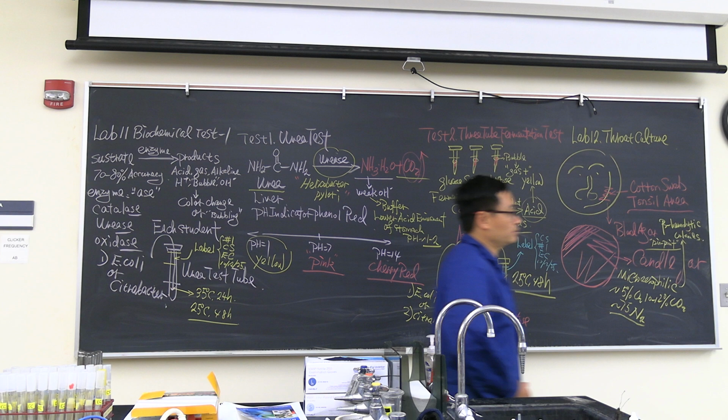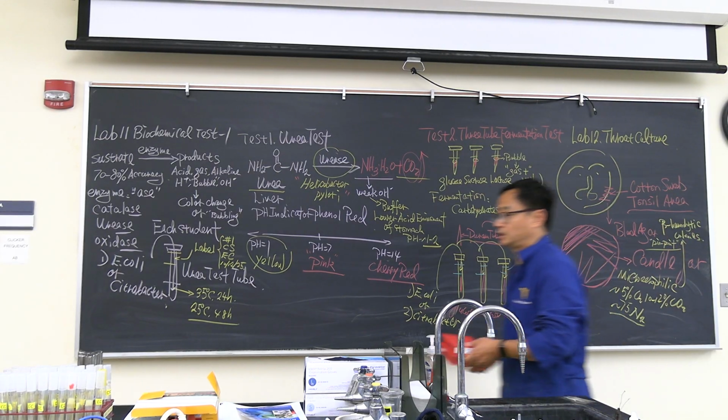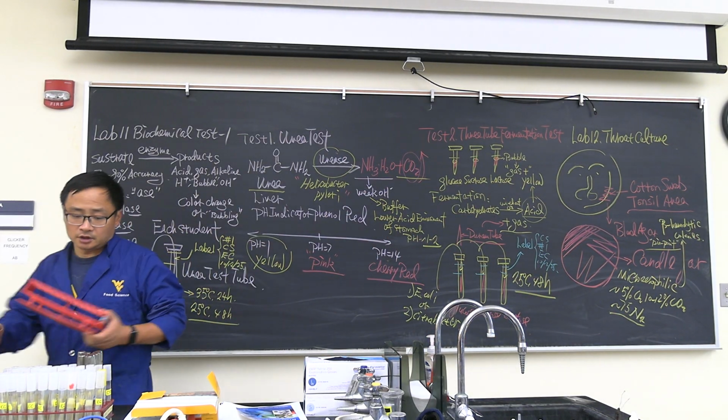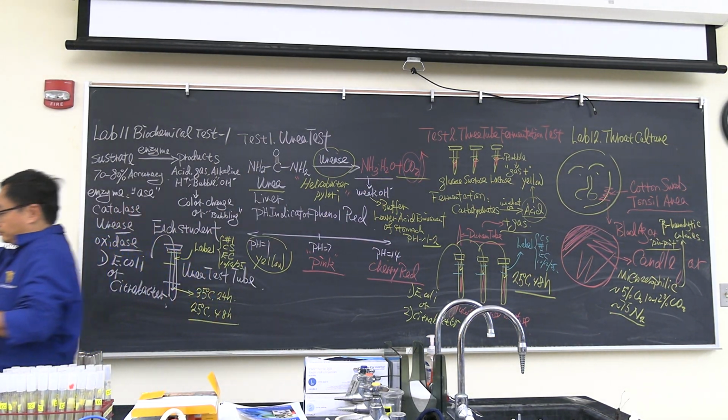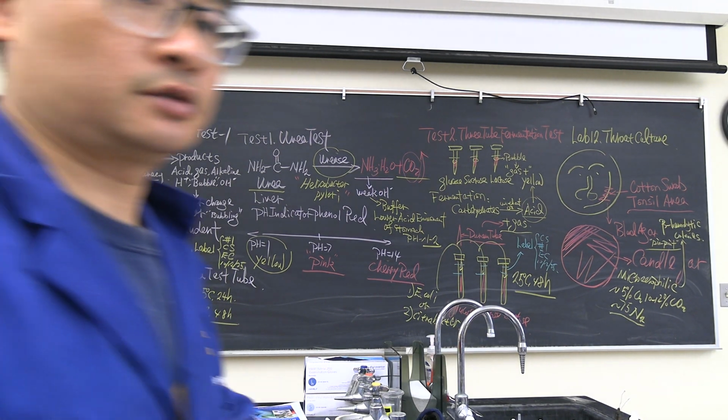I'm still going to do a demonstration for you. Although it's very easy, I would still love to do a demonstration for these tests. First of all, when you come here, make sure you do it in order: urea, and so on. Everybody come here, we'll do the demonstration.